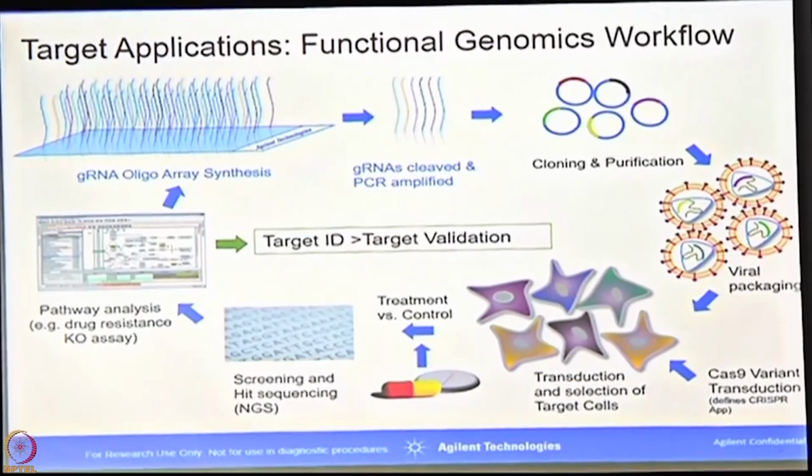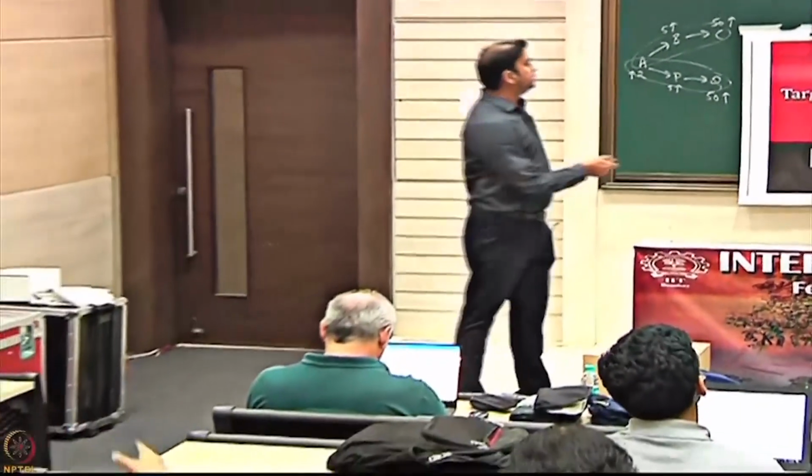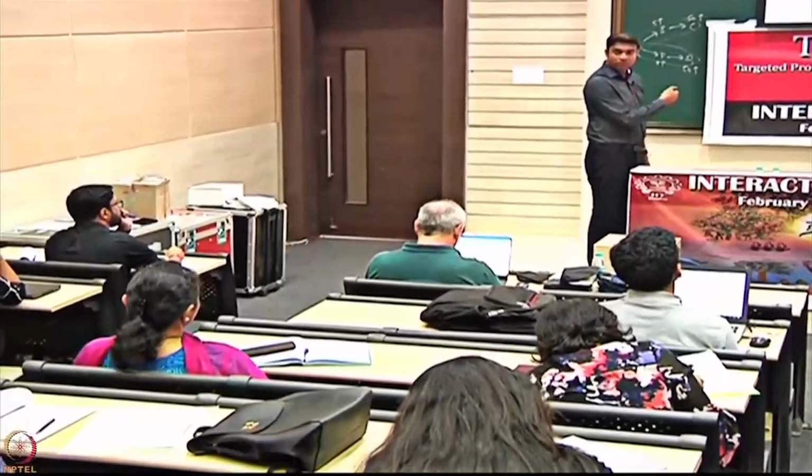The target cells are actually cell culture. Yeah, it's cell culture. And so it's a viral particle that transfers directly into these cells.